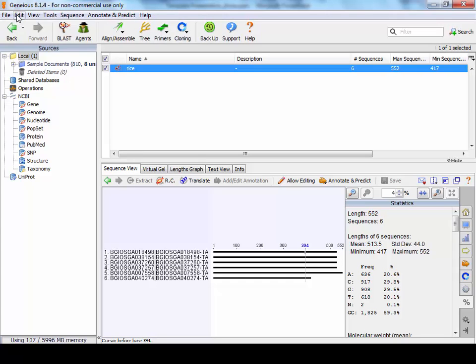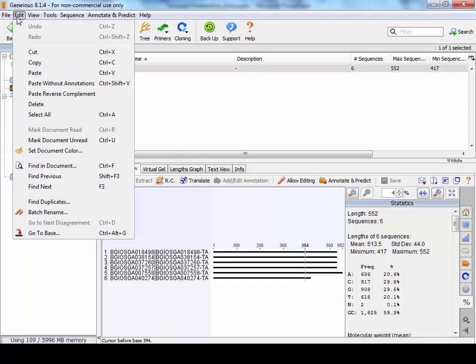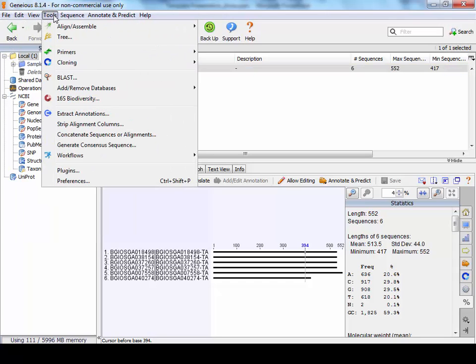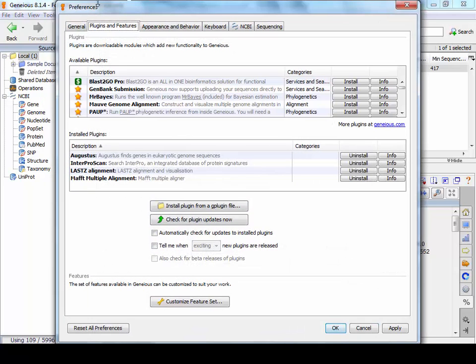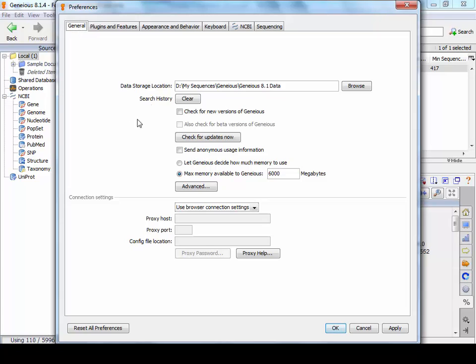But first of all, what you need to do is if you go to Tools and Preferences, then General, you need to check where you're going to keep your data. Now you can keep it on the D drive if you have a lot of room, which is fine.